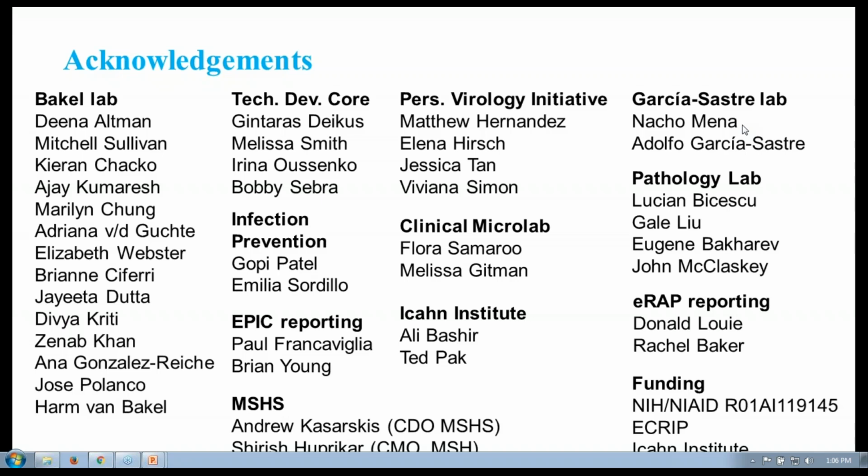Thank you. Cody, a question for you. What limitations in classifications and data interpretation have you faced due to available database sequences, which are mostly short read? That's always something that we worry about. With the 16S, we're really limited to genus level.